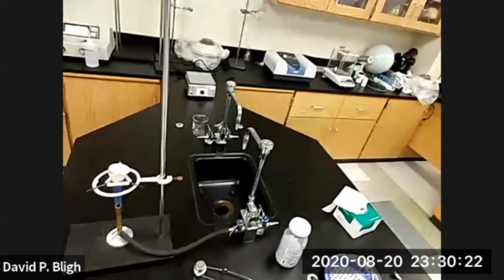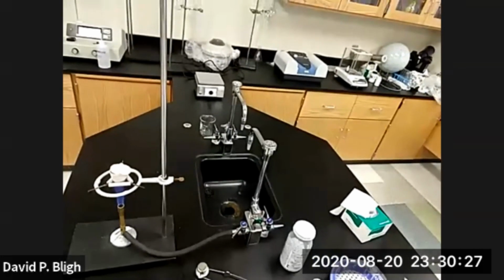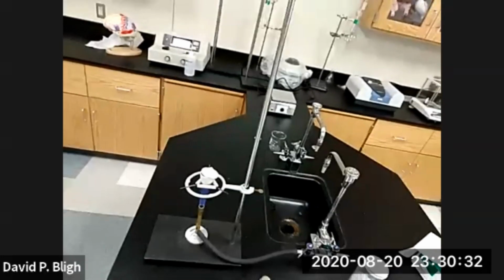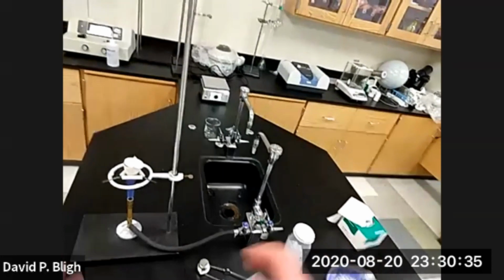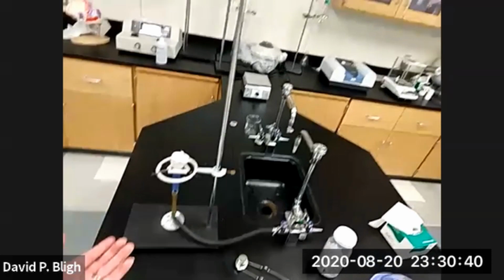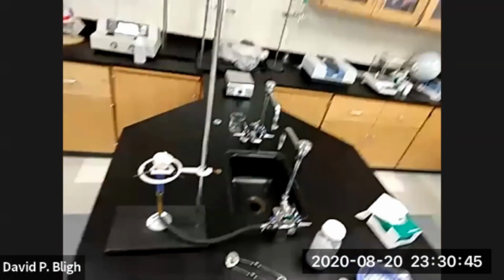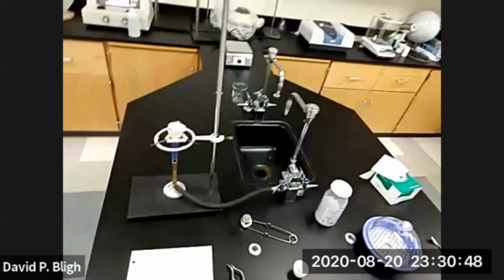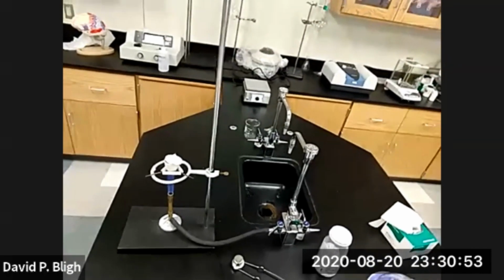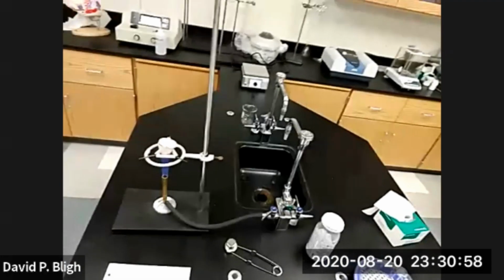How do you know the weight of the compound? Well, we do what's called, we measure the tare. We measure the mass of our crucible first. So then when we measure it again with something in it, all we have to do is subtract the mass of the container from the total, and we have the mass of the compound or the substance that's in the container, right? And we've set up our data table over there that I just showed you in such a way that we need to put in those values. Then we can do the calculations to get the other values.